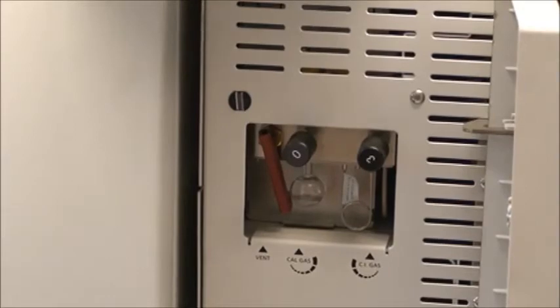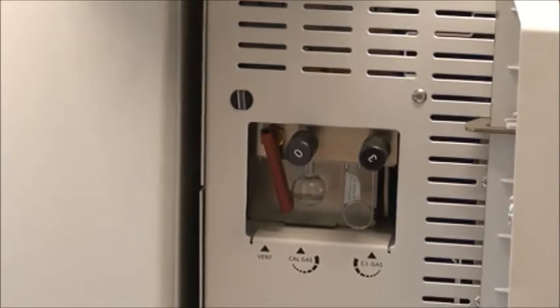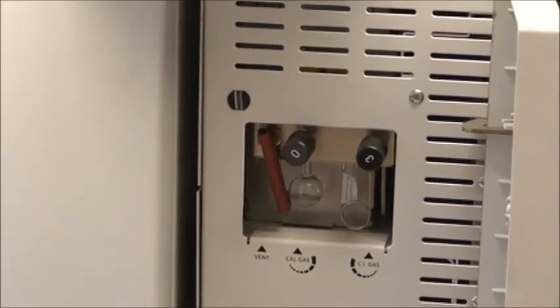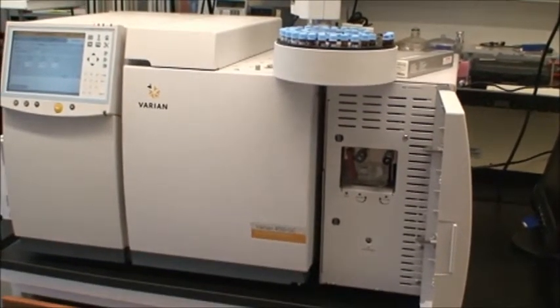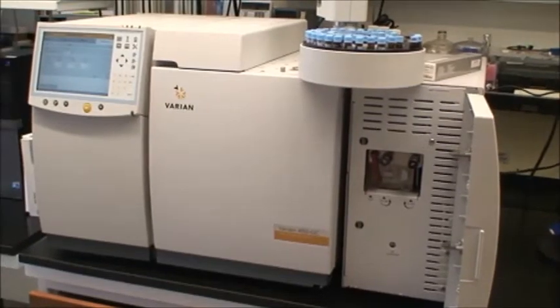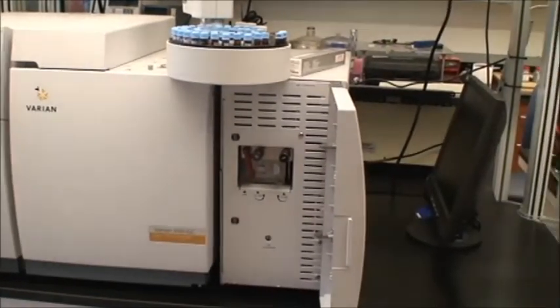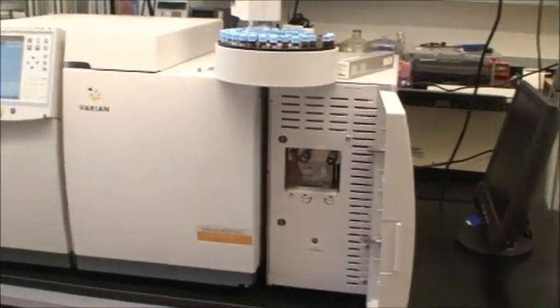The ion source is responsible for breaking the molecules up and giving them a positive charge. The ions are then filtered based on mass. The actual detector counts the number of ions with a specific mass and sends the information to the computer where a spectrum is developed.